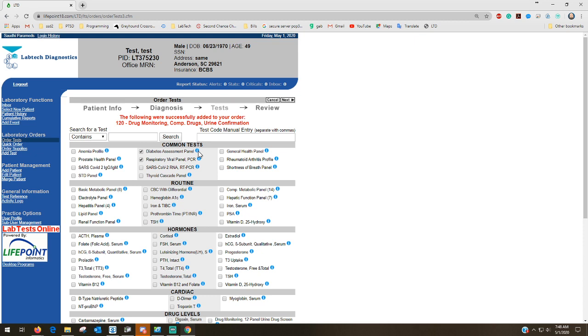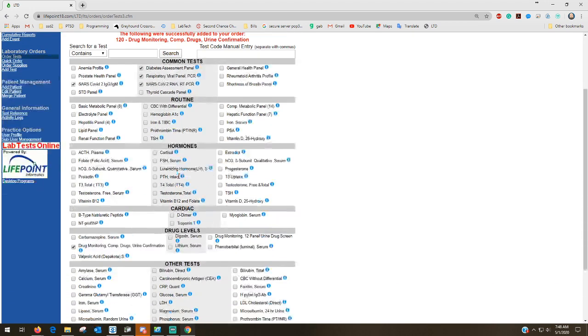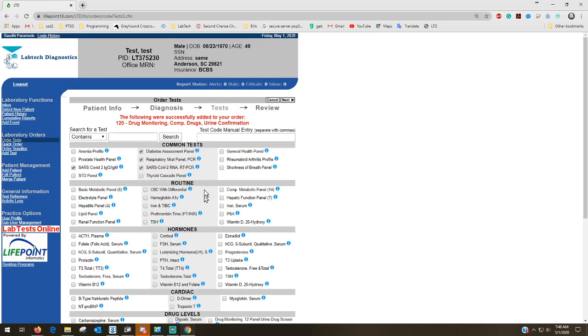Those are just a group of different tests that we've added, and you'll be able to pick those, and it will not show you the eye. But we've got a few picked. Oh, let's do the SARS because a lot of people that are coming on now are doing these tests. Once you've got all your tests done, you just click to the next again.